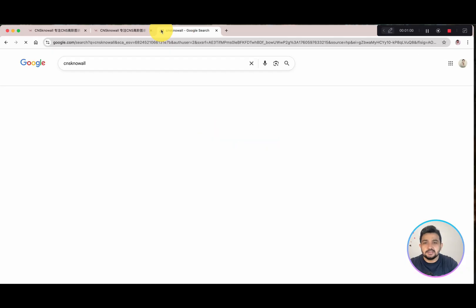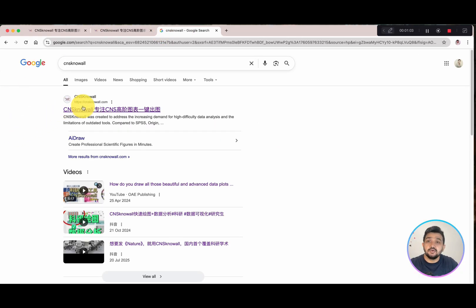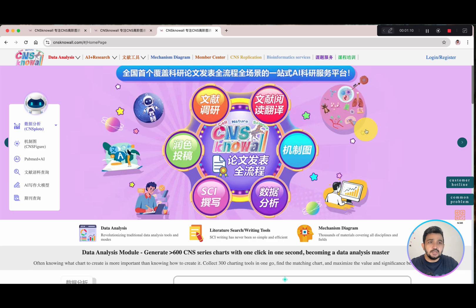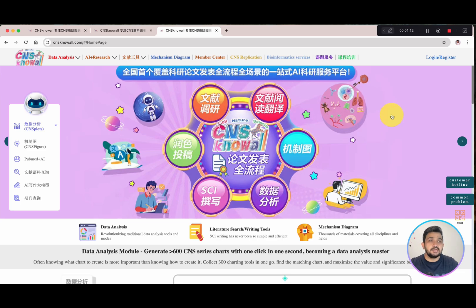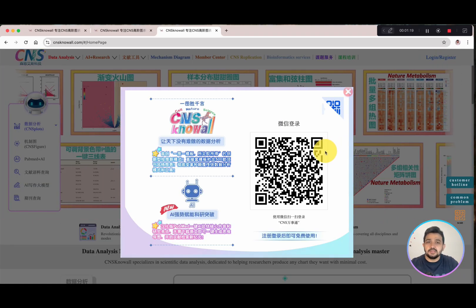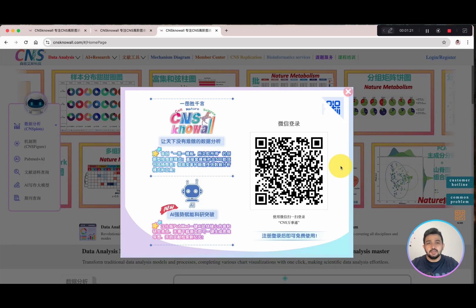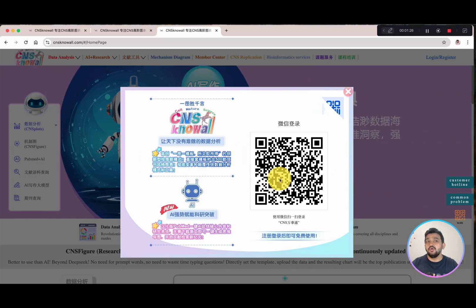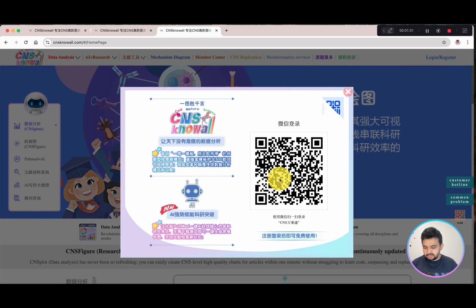You can go to Google and write 'CNS' — CNS stands for Cell Nature Science KnowAll. The website is cnsknowall.com. Once you click it, it will land you on their main page. You cannot do anything until you first register and log in. Go to the login and registration page, and you will see there is only one QR code. At present they have only one medium of login, which is WeChat.